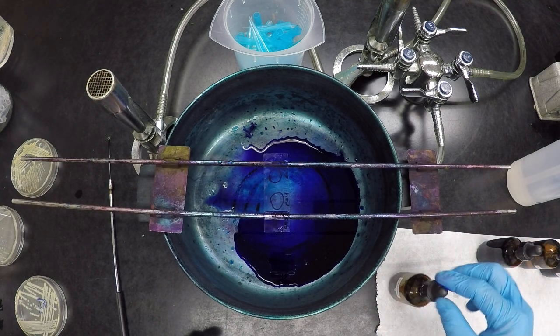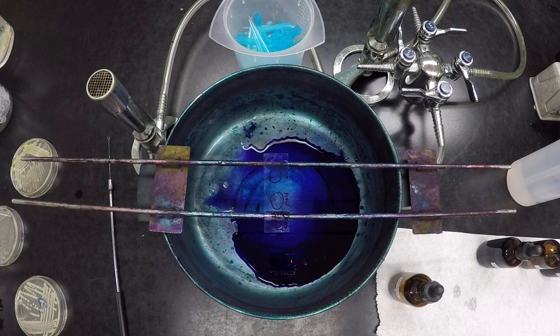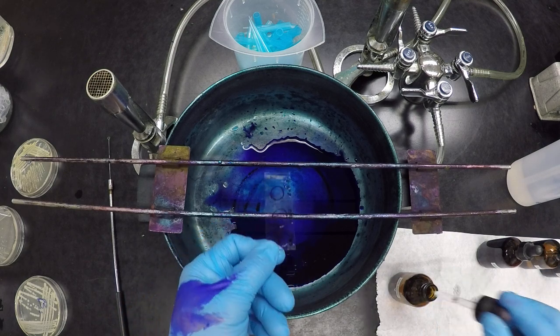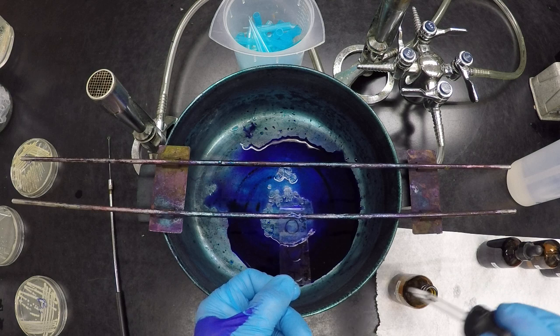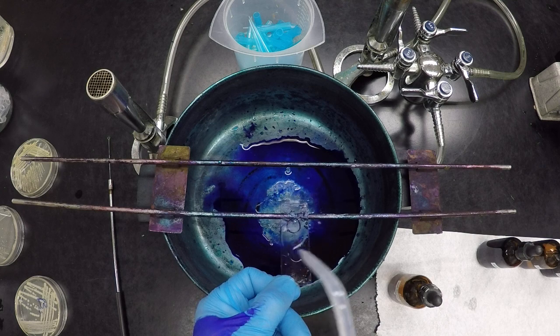Typically there's no real time to it, because the differentiating step is very dependent on the thickness of the smear. A very thick smear is going to take a little bit longer to decolorize, a very thin smear a little bit less. So what you do typically is you just hold your slide like this, you run the alcohol, and you just watch the color come off at the bottom, and eventually the color is going to stop coming, and then immediately rinse.